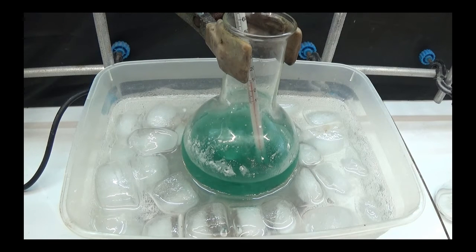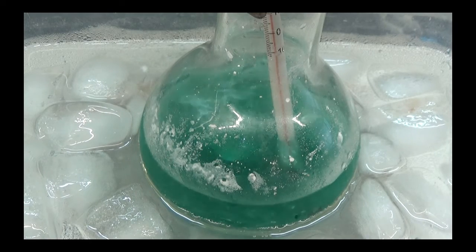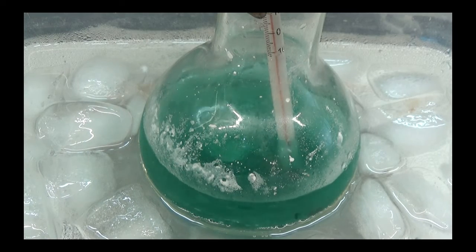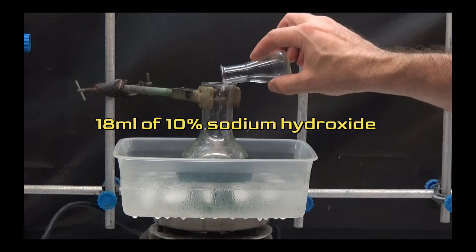Once half of the hypochlorite solution is added, the reaction changes to blue and almost all of the salicylamide dissolves. When all the hypochlorite solution has been added, cool with an ice bath.